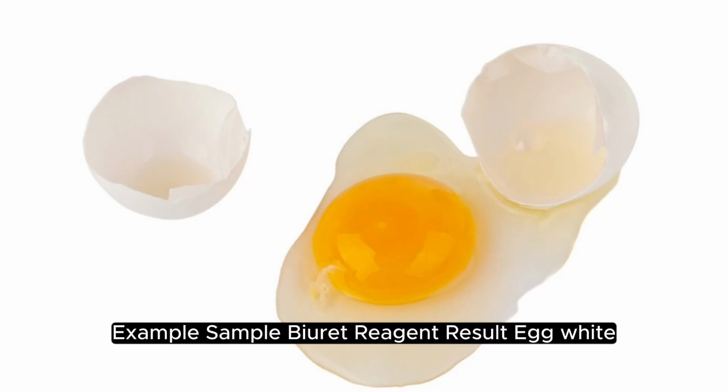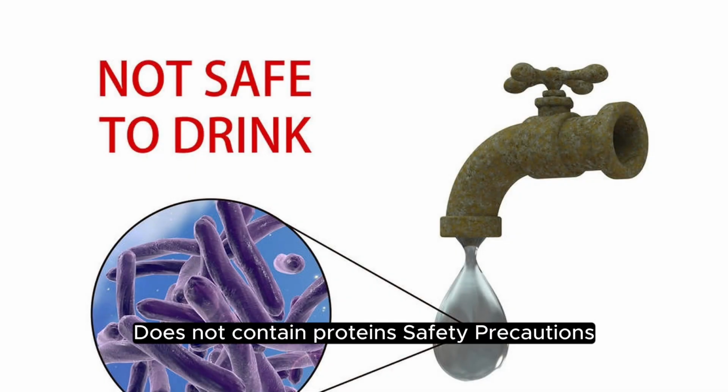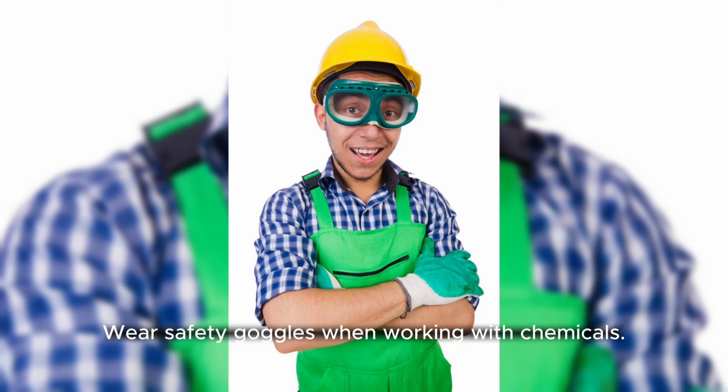Example: sample, biuret reagent. Result: egg white. Purple, contains proteins. Distilled water, blue, does not contain proteins. Safety precautions: biuret reagent is a corrosive chemical, so be careful when handling it. Wear safety goggles when working with chemicals.